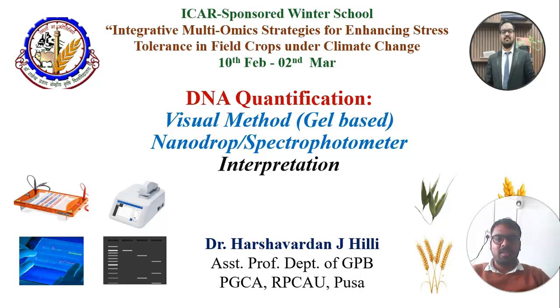So in the previous lecture we had already discussed the extraction of the DNA and its protocol. And now we are going to discuss the quantification of the DNA. So how are we going to quantify the DNA, how are we going to assess the quality of the DNA after the DNA extraction? All of that we are going to deal with in this particular lecture.